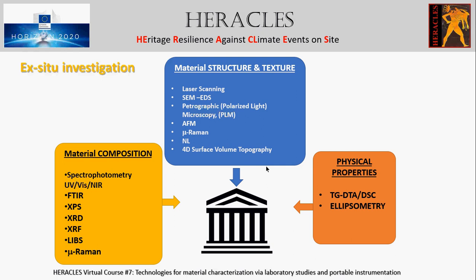Scanning electron microscopy gives valuable information regarding the morphology and microstructure of the sample under test. These data, mostly qualitative, are extremely useful because they document the current morphological status of the object under study, but they can also drive and guide consolidation procedures.